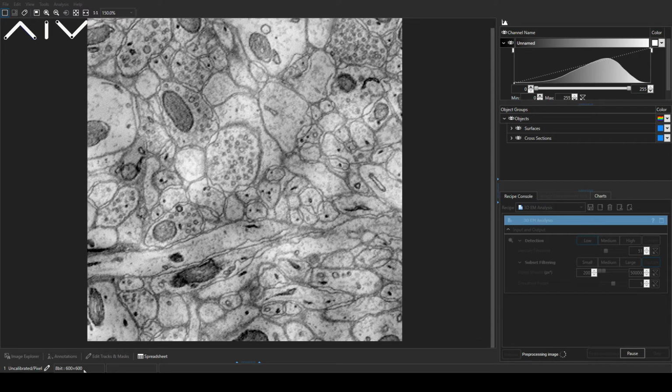If you have more images, it will just take 30 seconds per image. And that's why I'm not showing you a full stack, because it could take easily half an hour or an hour to run if you have a bigger data set. But still, if you compare that to manual segmentation, where it would take weeks or sometimes even months, depending on the complexity of the data set, the density, and also what kind of software you're using, of course, then it makes a lot of sense. It's just an hour or something like this versus weeks.